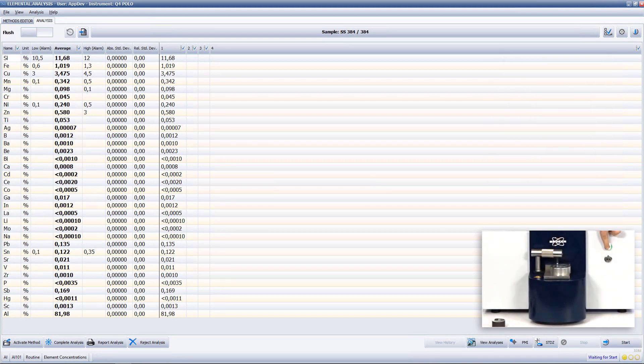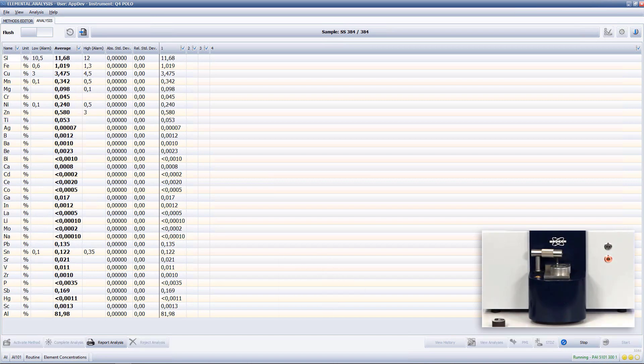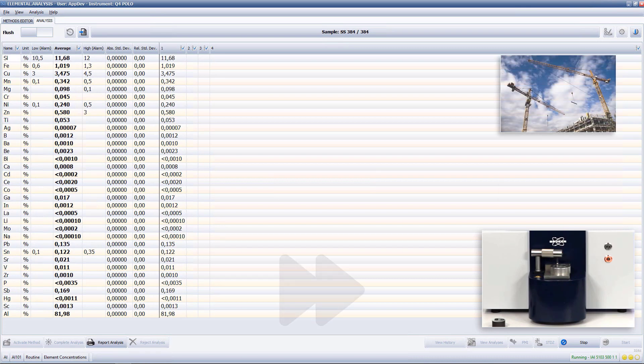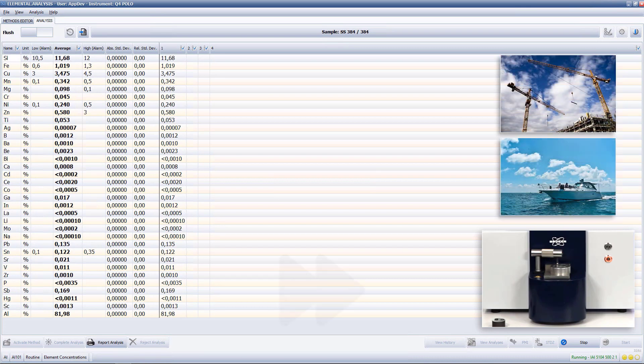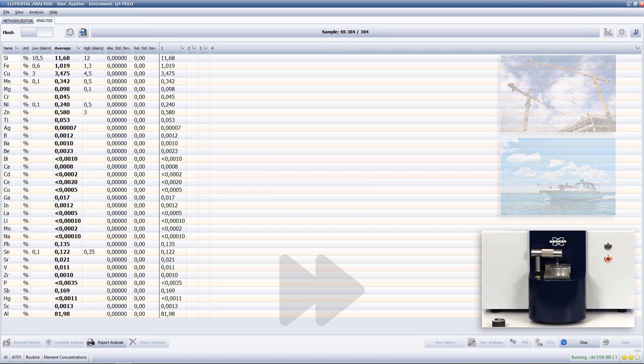5000 series, due to magnesium addition, has high strength and corrosion resistance. It is used in construction and marine applications.